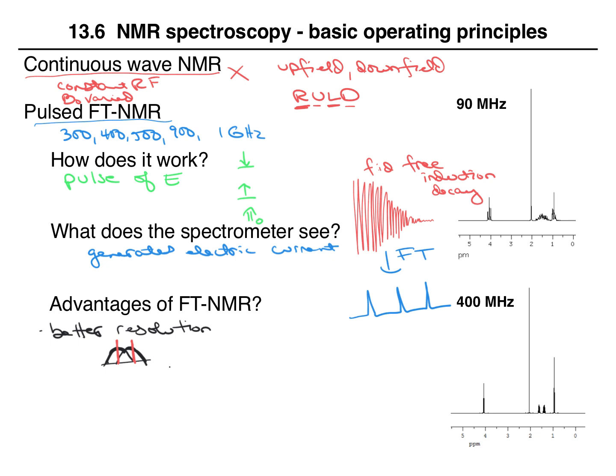And that's what we have over here. This signal is at the same ppm, this is the same, this is the same, and this is the same, but we can see much more detail. Here, these signals are overlapped on top of each other, whereas here, these signals have been separated. And so by going to a higher field strength, we can get more detail in our spectra.